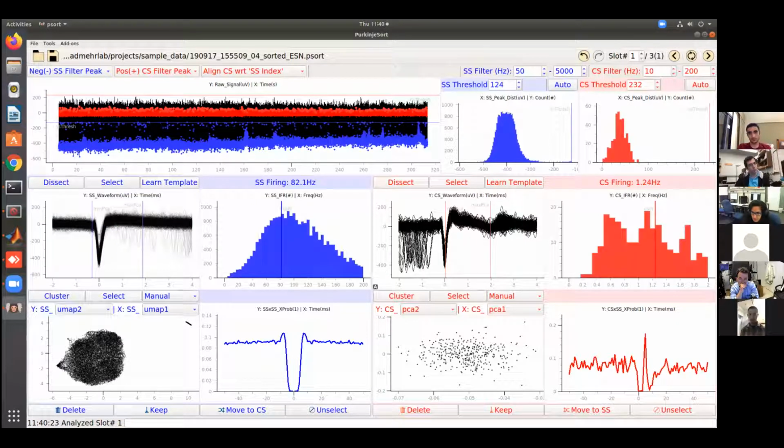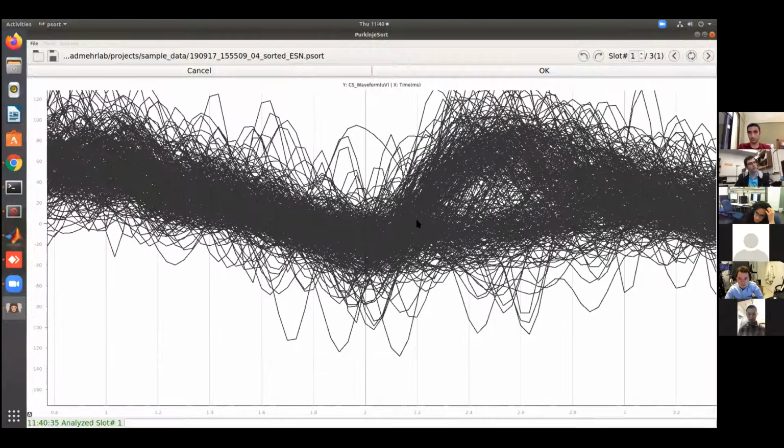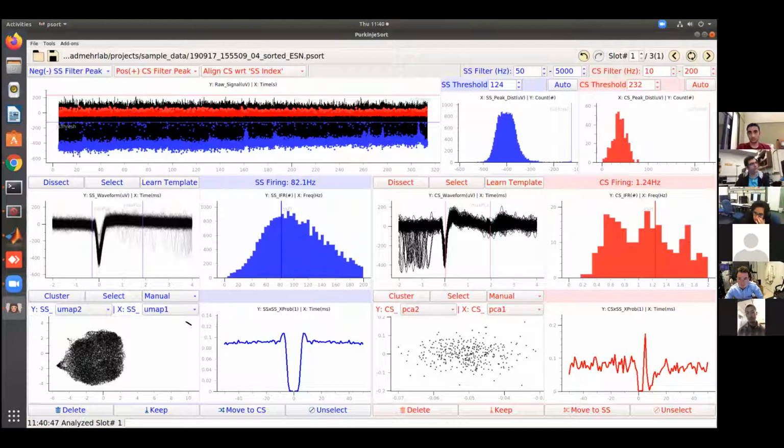To the CS here. One thing that Guy, might be kind of answering your question, is that these complex spikes that we have here, so let me go here and then looking at them, some of them have this extra bump, some of them do not have that extra bump. You see that? Now I don't need to form the template because I detected my complex spike from here to here. So they are already aligned based on their simple spike content. So when you bring a complex spike from here to here, you don't need to form the template, and you don't need to refresh.